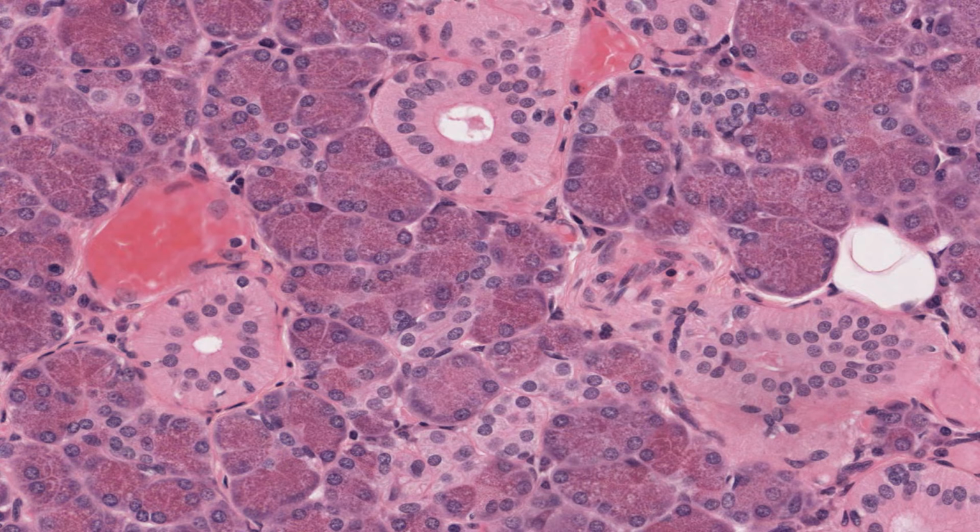Because mitochondria have large amounts of insoluble protein, cells with a lot of them stain bright red with hematoxylin and eosin. Here, the elongated mitochondria are arranged vertically at the base of the cells. If the ducts are especially well preserved, the mitochondria appear as fine radial striations at the rim of the duct. For this reason, striated duct is a synonym for these secretory ducts. Unfortunately, our material is not well preserved to show these striations distinctly, although the image gives indications or a hint of them, which I've arrowed.